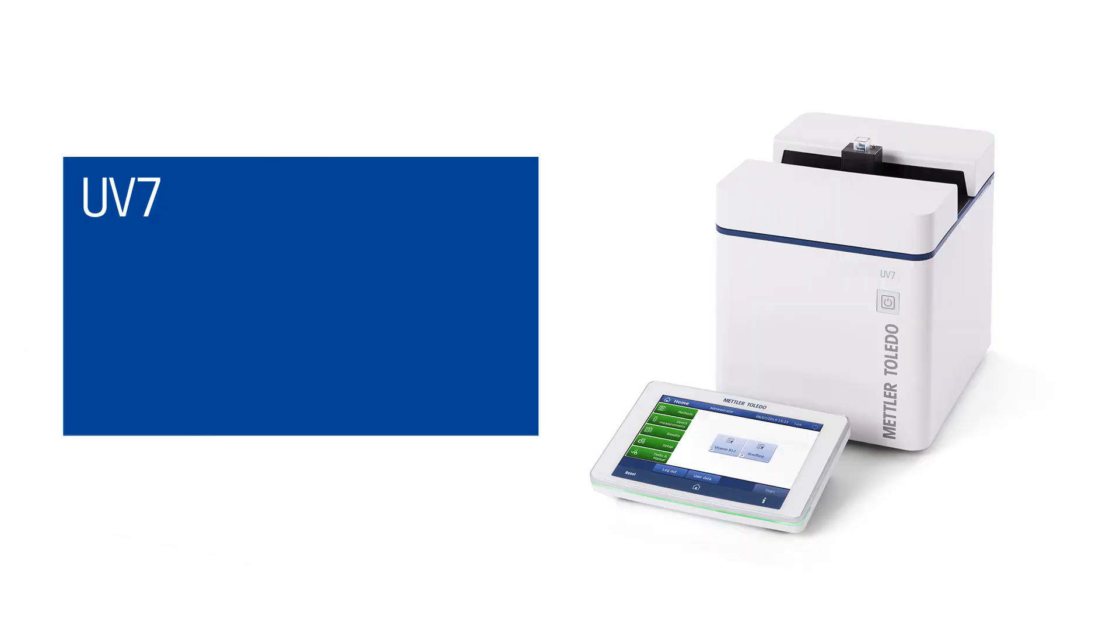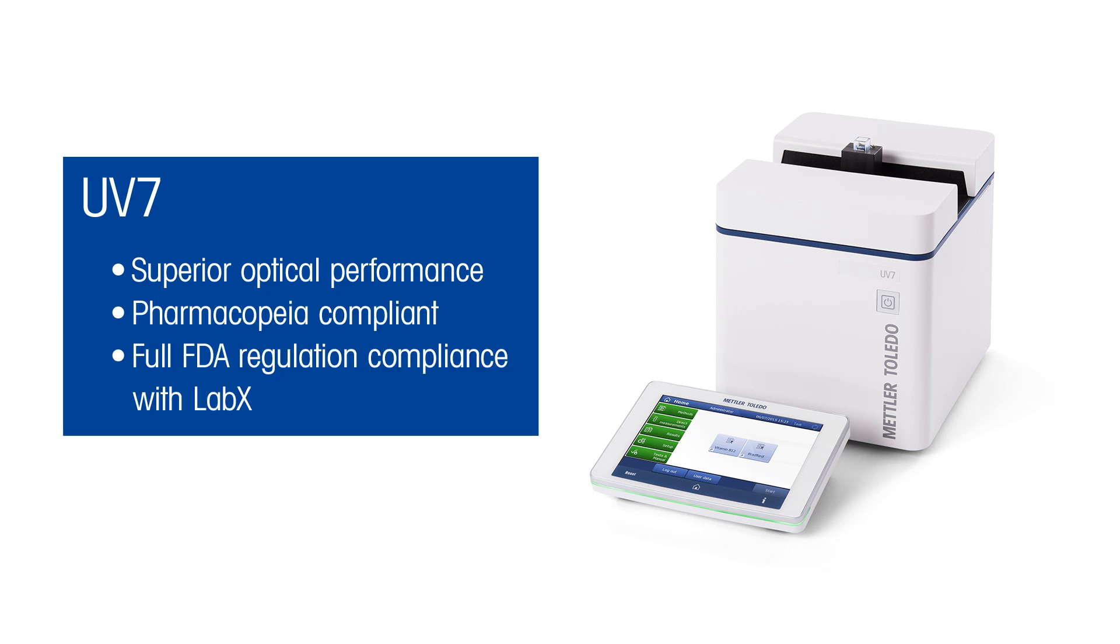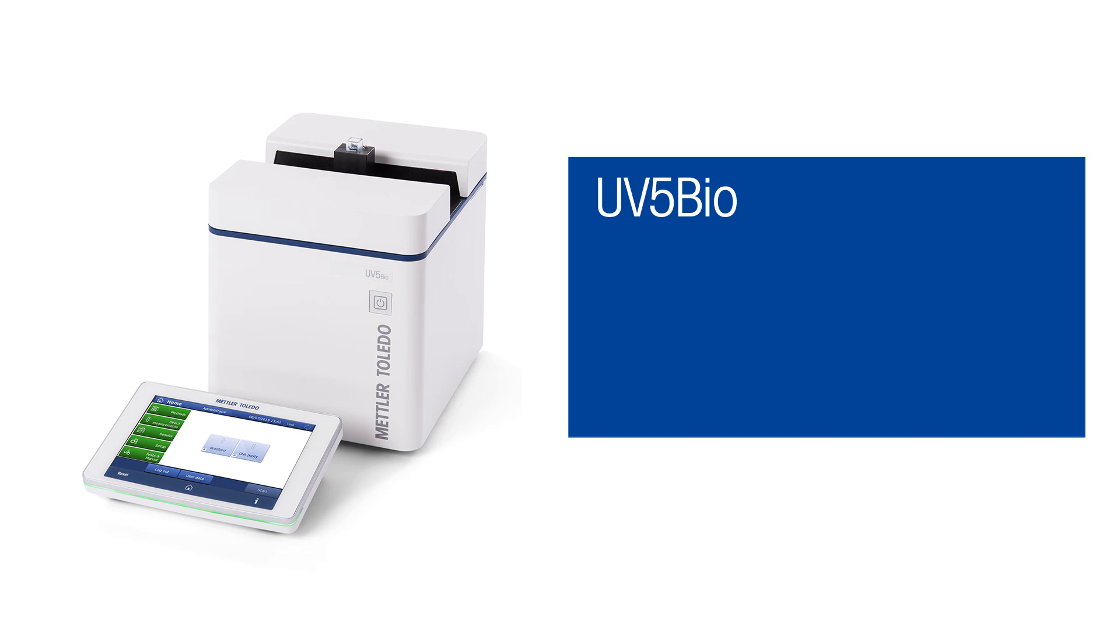The UV7 provides superior optical performance, pharmacopeia compliance, and fulfills FDA regulations. The UV5 bio is ideal for cuvette-based measurements in life science.